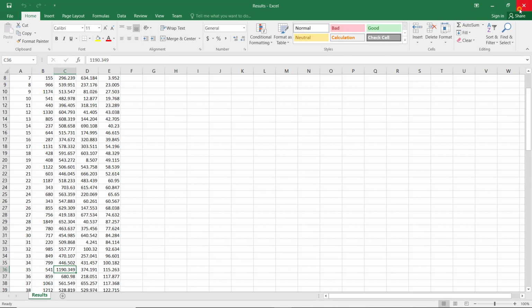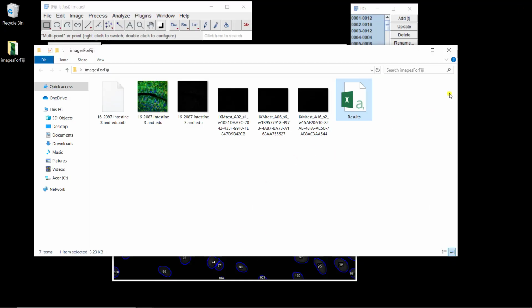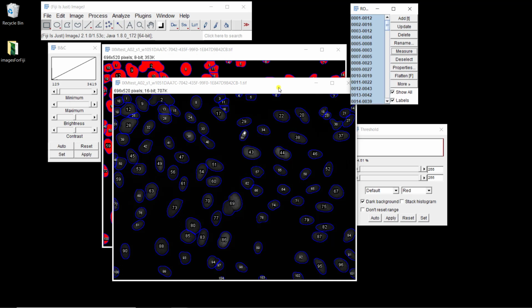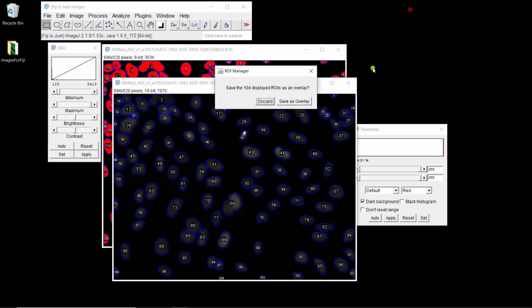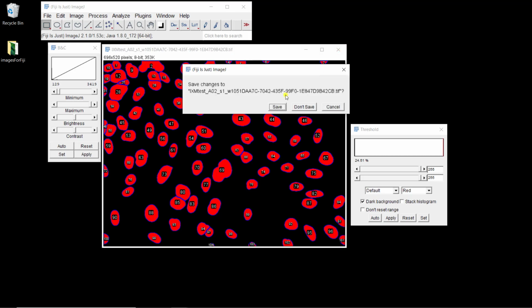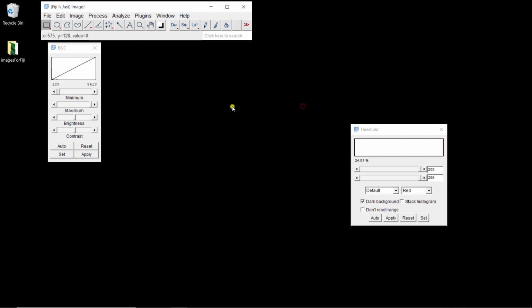Okay, that's nice, but if you have 100 of images that you need to analyze, you don't want to click for each step, especially because first it's going to take time and maybe you're going to make a mistake. Now, if you want to do that, there's a very powerful tool in Fiji, which is called a macro recorder.